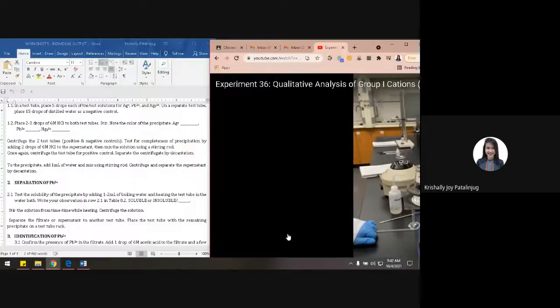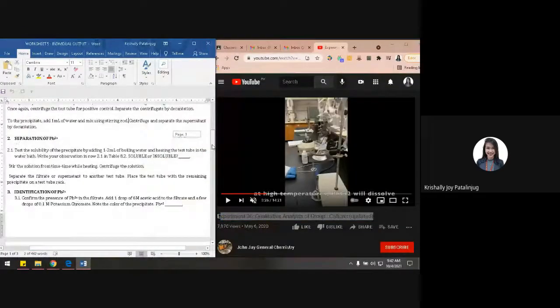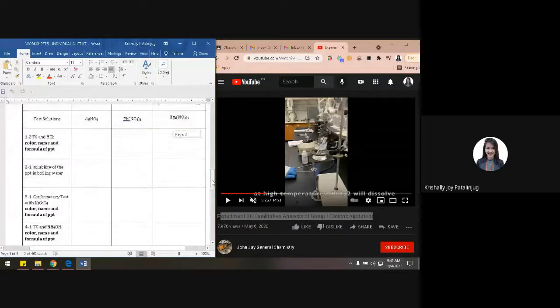So you know already if it is soluble or not. Okay, so asa ilagay ang sagot dito sa baba. 'Di ba nilagay mo dito na precipitate is lead chloride? Upon reacting HCl, the precipitate is lead chloride. For the solubility with boiling water, dito ka lang maglagay ng the one that is being asked to you.